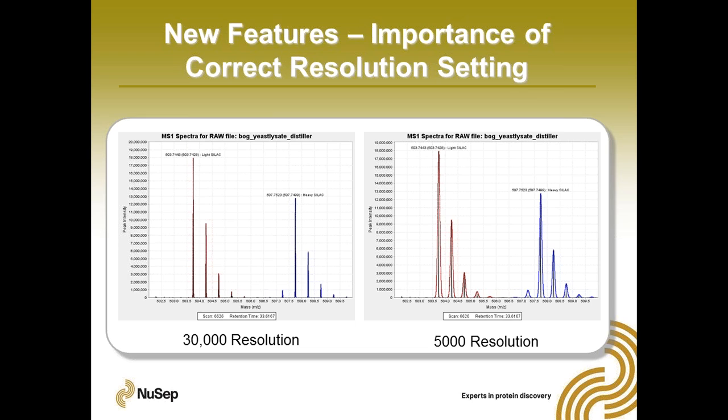So what I recommend is taking one file, running it through ProteoIQ, setting the first pass resolution, having a look at it, adjusting it, looking at some additional spectra, and picking a good setting, because it could be that 22,300 looks the best across most of your peptides. Then you go back and run your full project after that. Right? But the key here is this fit needs to be as close as possible to the experimental data.